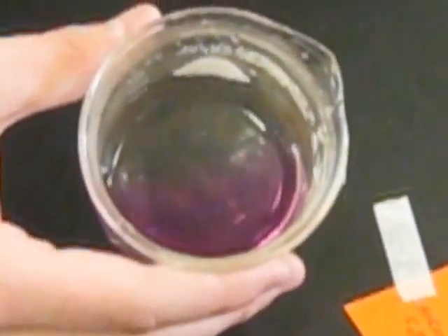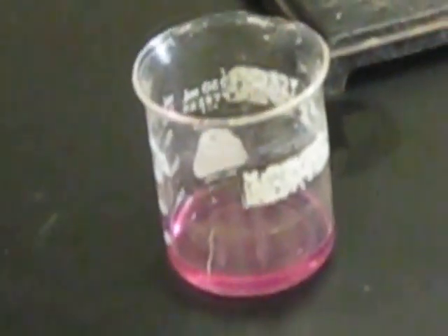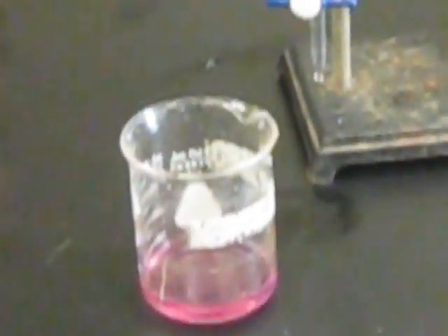Okay, so the color started to hang around. It looks like we got about the color that we needed right at the start there. So what we're going to do now is just stop adding the base and take our reading off of the burette. And it's looking to be about 14.7 milliliters of the base.